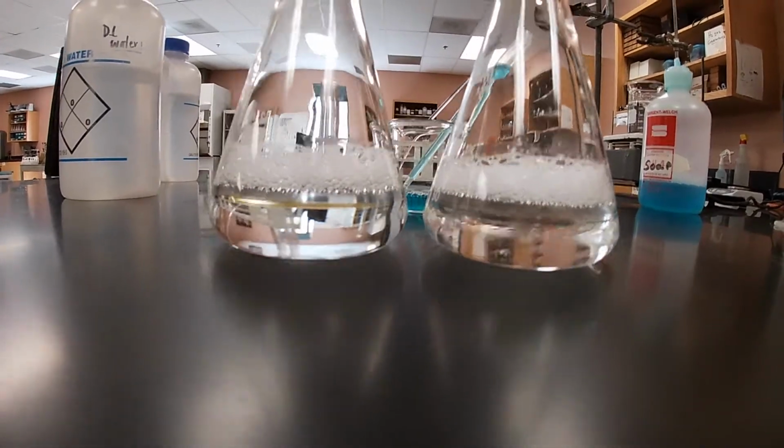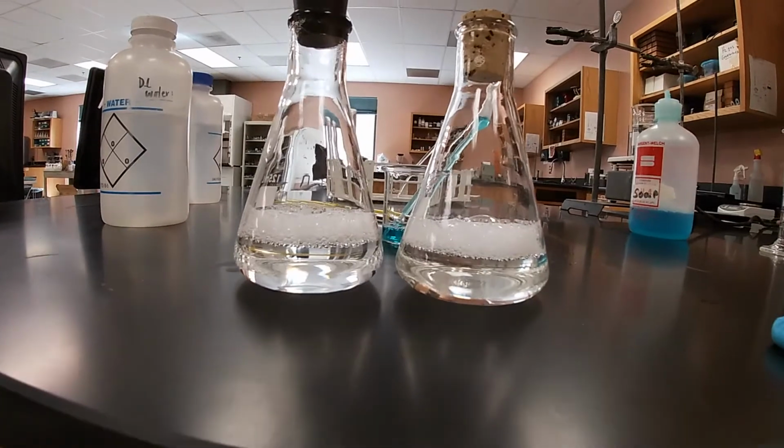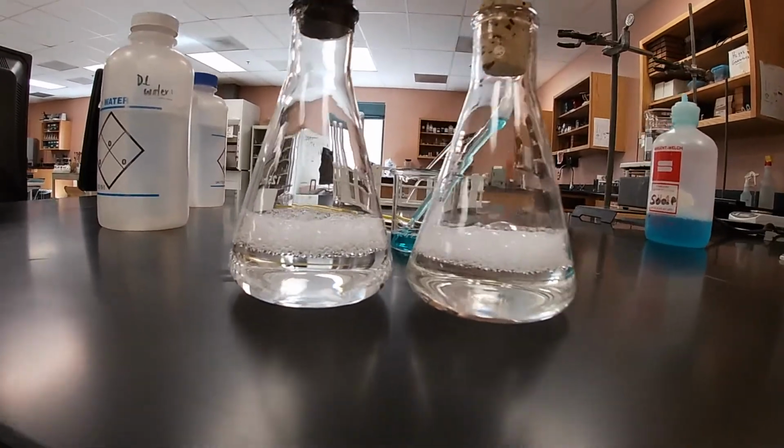All right, so it took us a total of 4 drops for tap water, and that's the only sample I have. I wish I'd have brought some more samples with me. Just go ahead and record that.